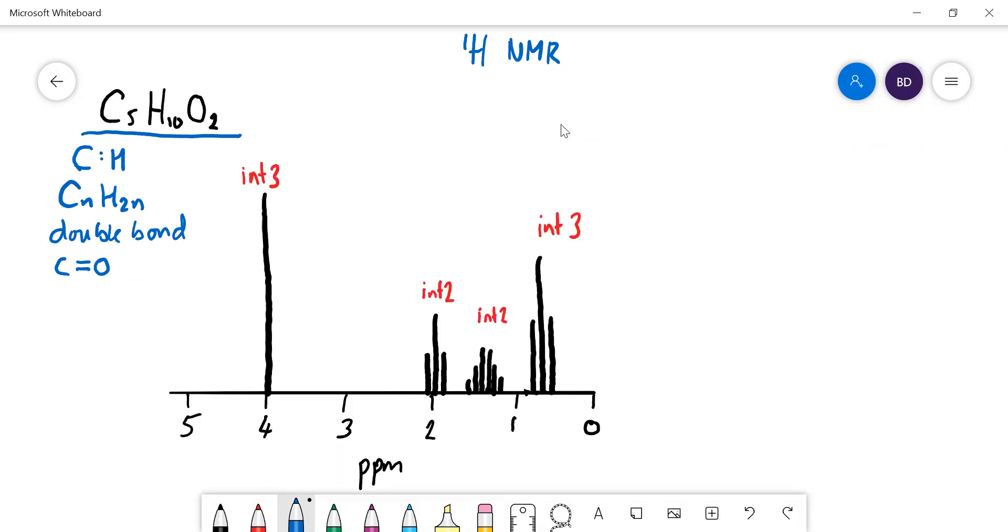So you've got two oxygens in there, so let's have a think. Could it contain a carboxylic acid group? Well, we know fairly quickly it can't because this proton here would give a ppm of about 12, a really high ppm, and there's nothing anywhere near as high on this spectrum. Also, there's nothing that's got an integrated value of 1, so we can't have that. Likewise, we know this molecule is not going to contain alcohol either because that would give us an integrated value of 1, so we can rule out all these things.